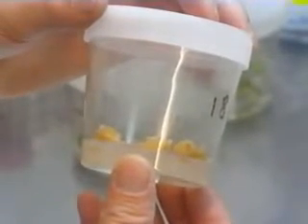The initiation of callus from the cut surface. Therefore, the medium selected varies with species, cultivar, and the type of explant to be used. Control of development is achieved by manipulating the levels of auxins and cytokinins in the medium. If axillary shoots are desired, moderate levels of cytokinin, such as BAP, kinetin, or 2iP, at concentrations of 1 to 5 micromolar are used. The auxin level must be kept very low or omitted altogether.